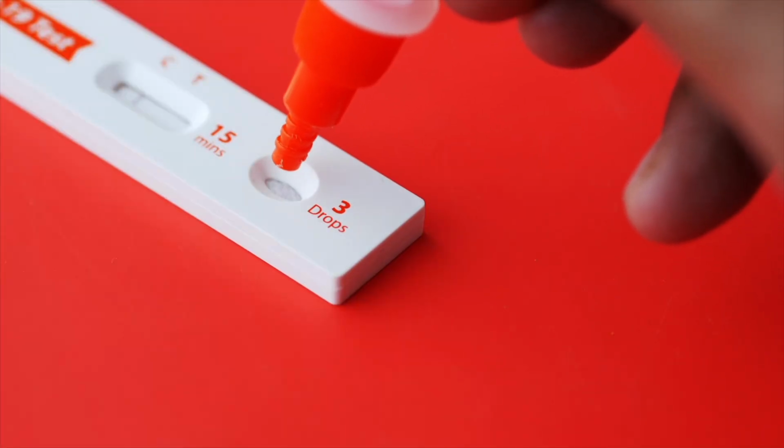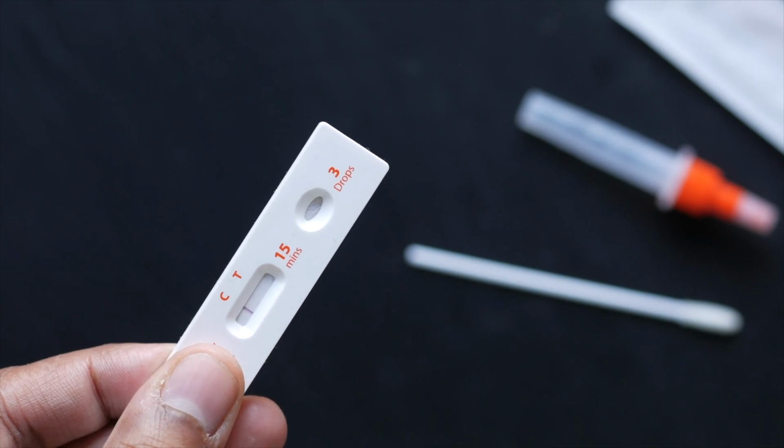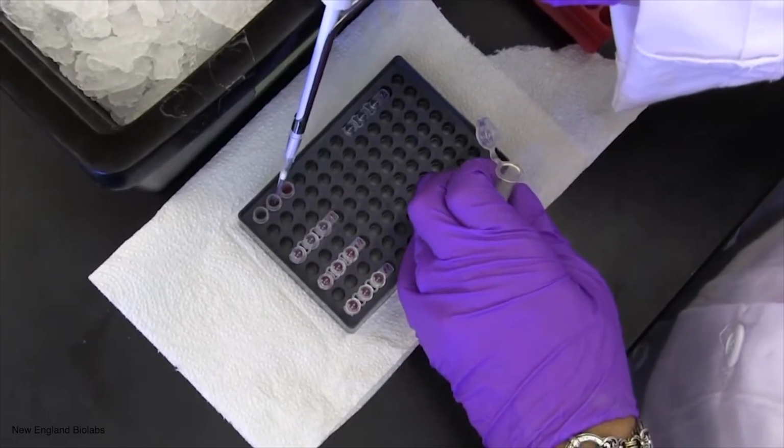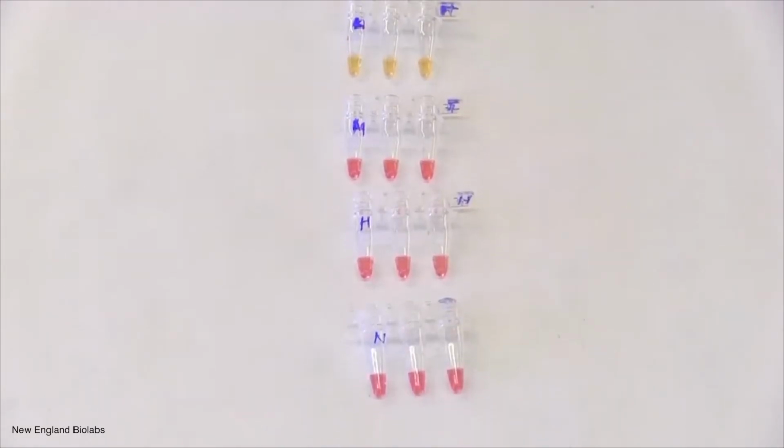But to me, one of the coolest features about LAMP is that the results can actually be read out with the naked eye, meaning we don't need any reading devices at all. The products of LAMP reactions can be made visible, for example, on lateral flow assays, similar to the antigen tests we all know from the COVID-19 pandemic. Or, for example, through a color change of the reaction medium, here shown from pink to yellow.